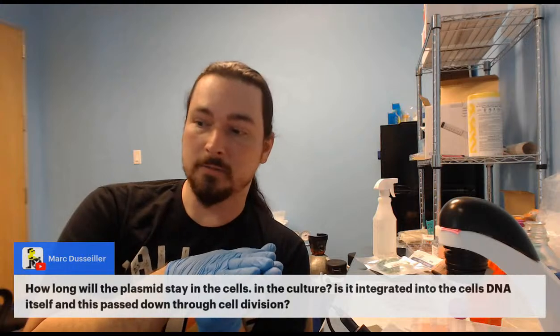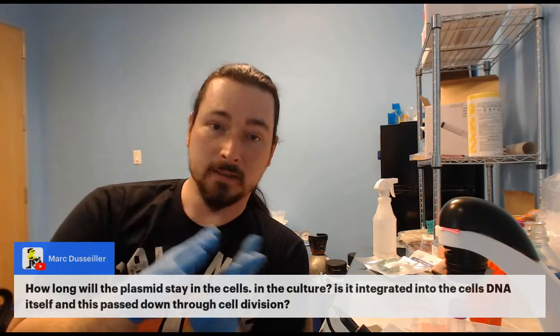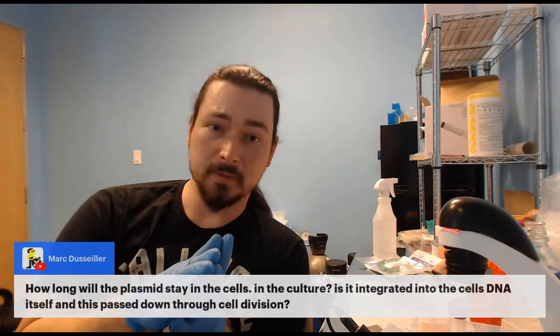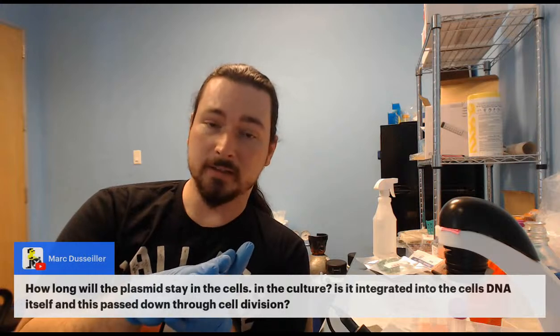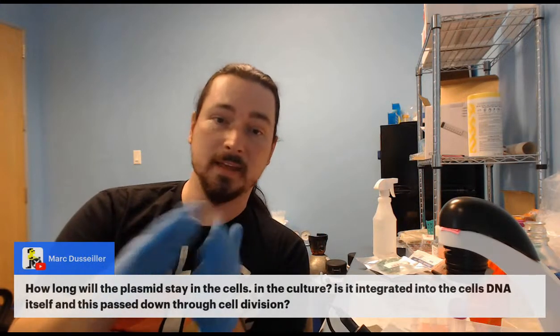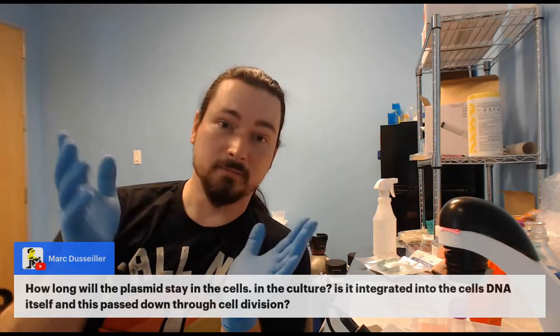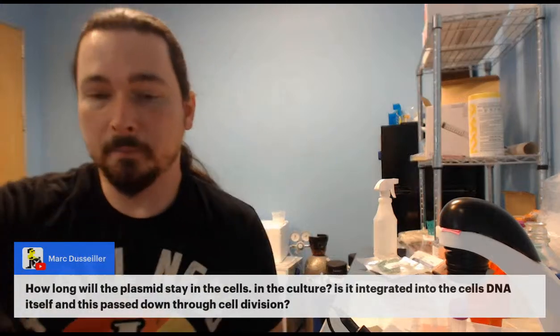Now, if the DNA does integrate, like if you keep selecting hard for a long time and randomly the plasmid integrates, then it can become stable and it'll actually integrate into the genome just by chance and stay there. Then you can just keep reproducing those cells, and they'll just keep reproducing that plasmid because now it's part of their genome.